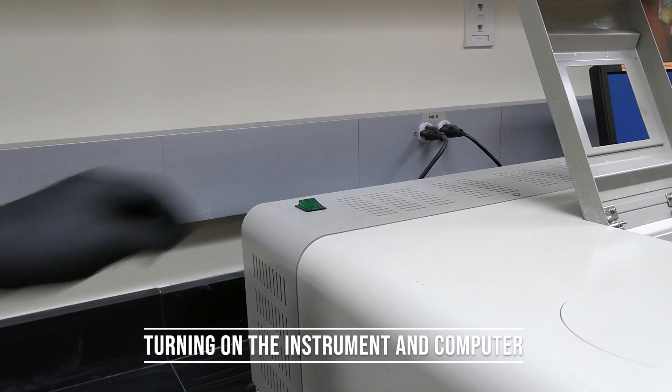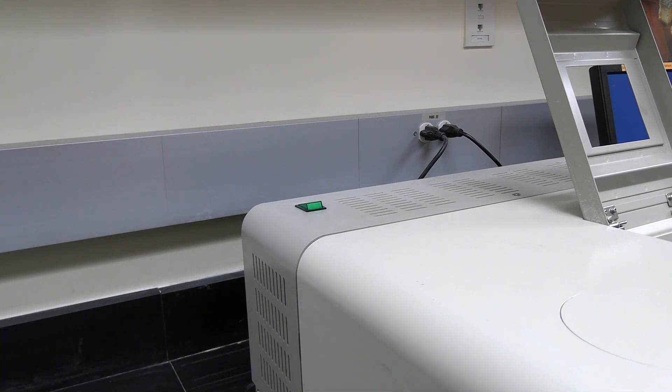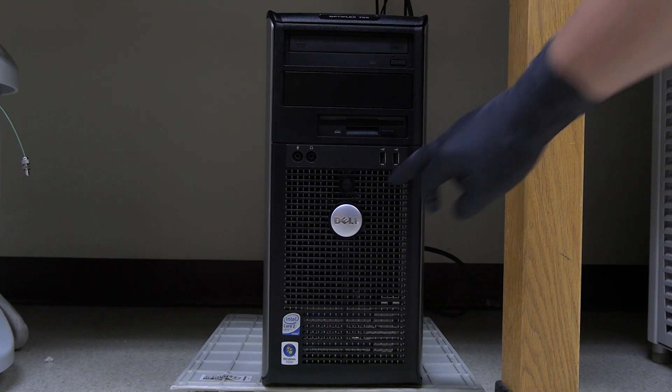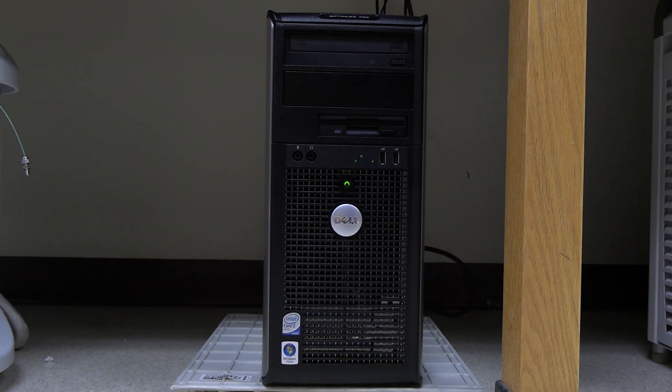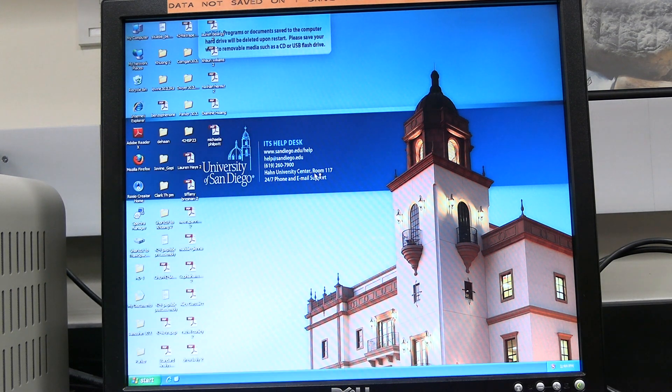Turning on the instrument. Flip the power switch on the top left back corner of the instrument. The switch light will turn on. On the computer, press the power button located in the middle of the tower. Log in to the computer. The username and password are found in the instrument SOP. Wait for the computer to start up.